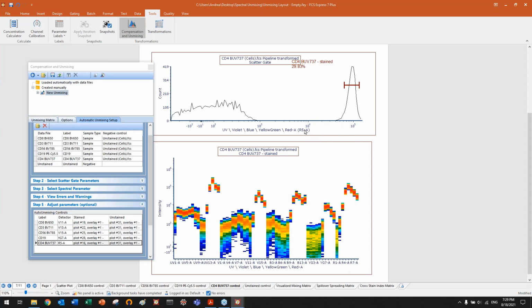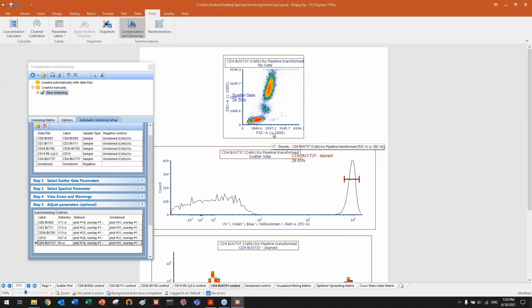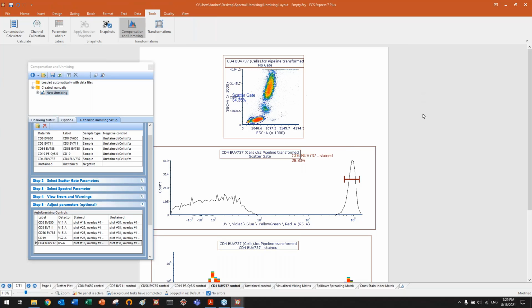There is also another way in which you can do this, but this depends on your user options. If you look at these, you see I do not have any access to the single detector. The same if I open the parameter list from the density. I have no access to the single detector. This is why I cannot change the brightest channel here. I have to go to step 5, which is easy to do. It's super fast. But I want to mention also the other option.